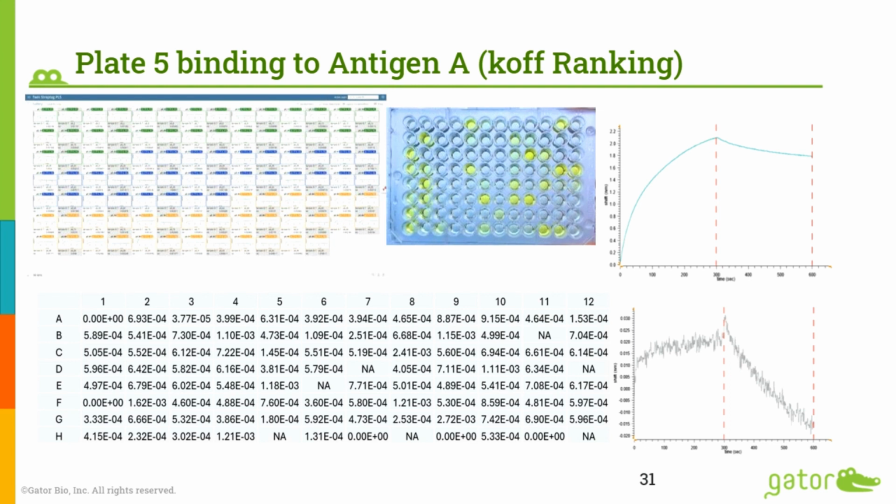Just one plate we picked, and this is his ELISA selection. And I know the small cartoons here are very tiny. But our software gives you a value of all the KDs. When we zoom in on just one plate position, you can see that when one supernatant or periplasmic solution is binding, it shows a very nice association followed by a dissociation curve. But when you don't have something binding, all you see is noise, right? And this matched very well with what he had selected using his ELISA.